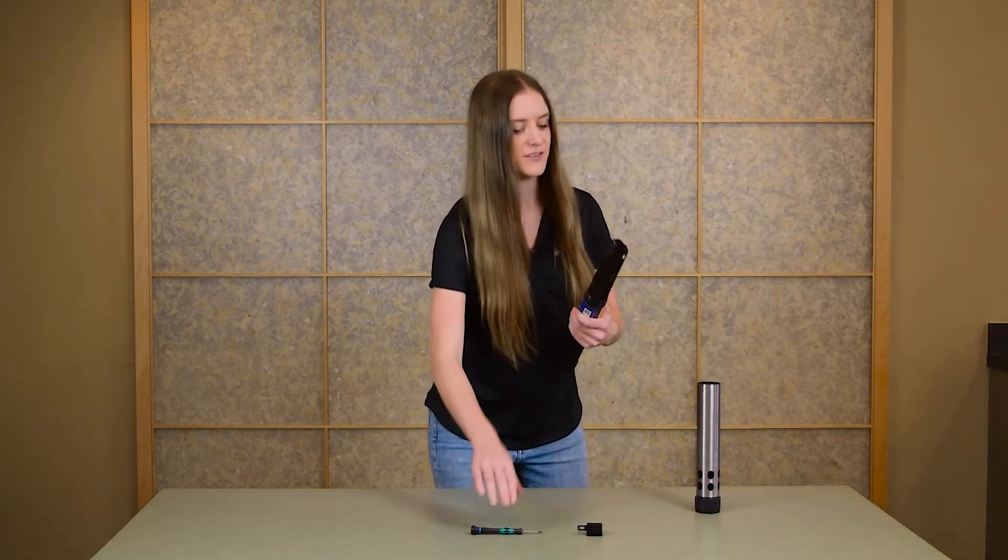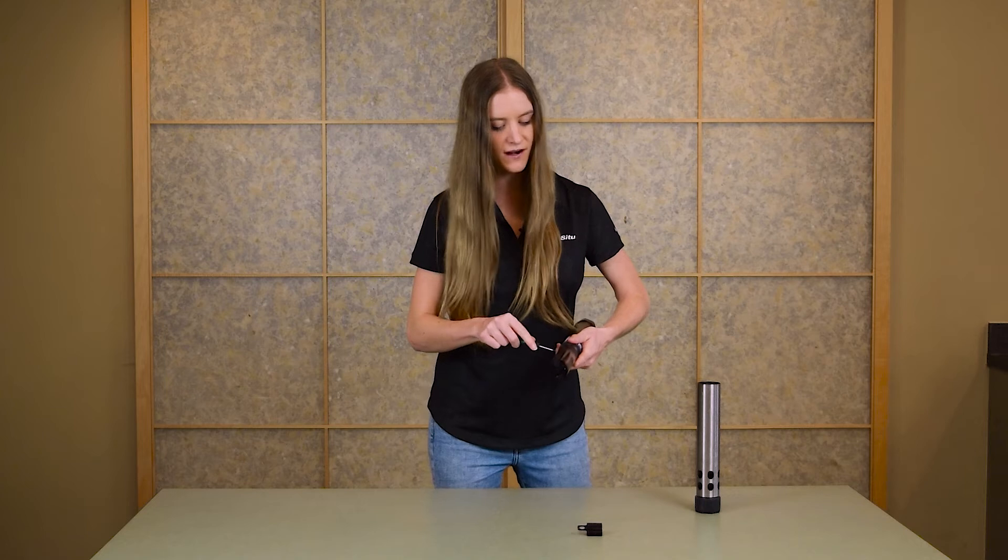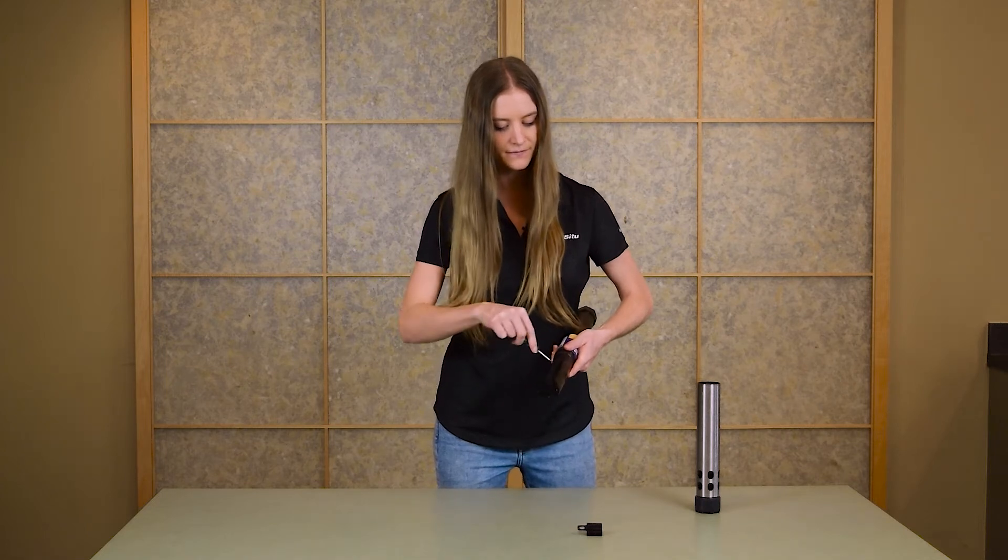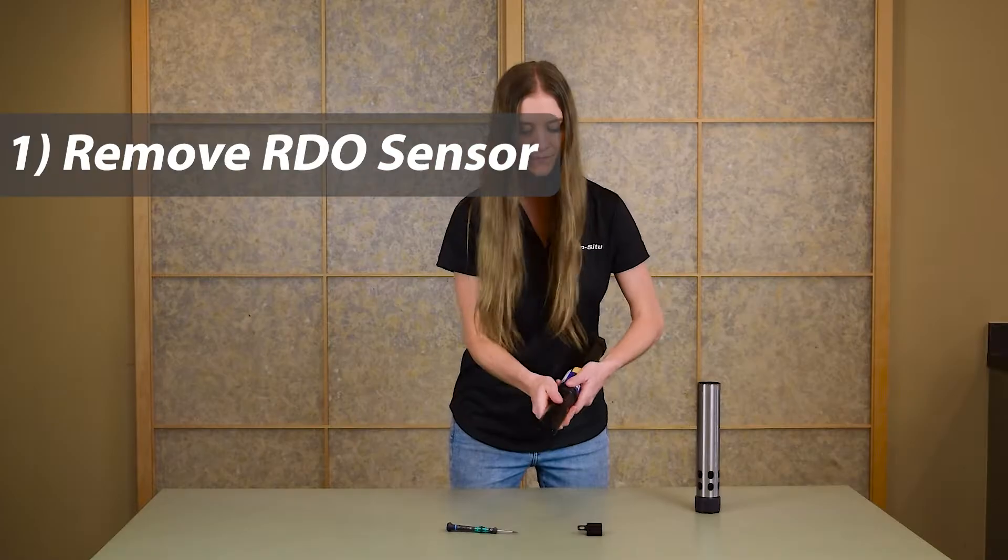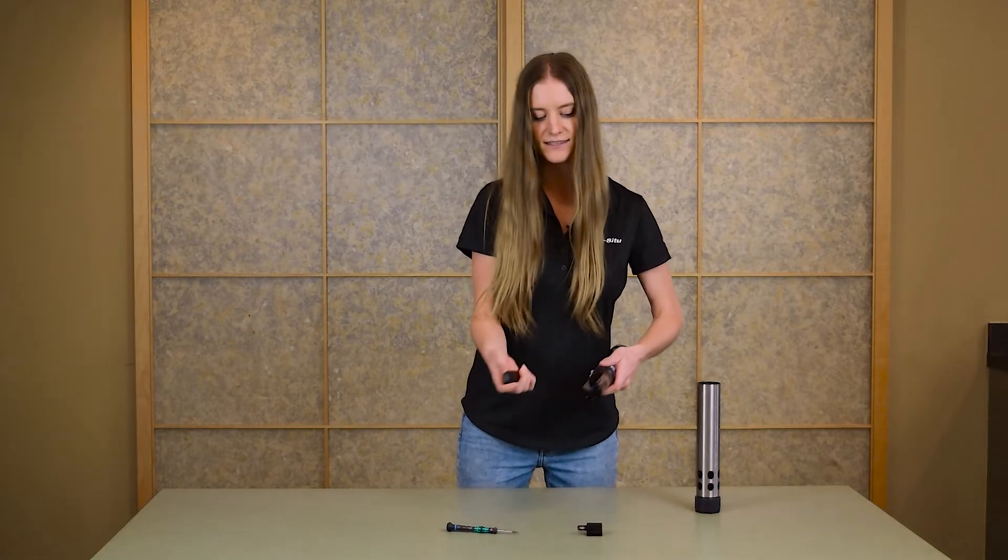You'll begin by removing the restrictor and then find and remove the RDO sensor. Loosen the sensor set screw at the base of the sensor and then slide the sensor out of the instrument.